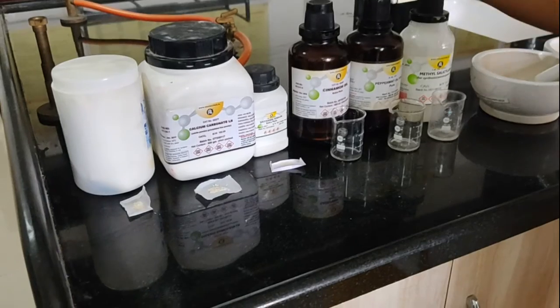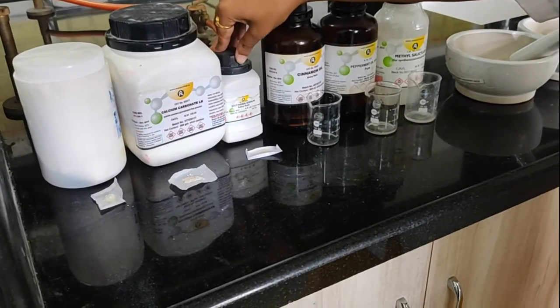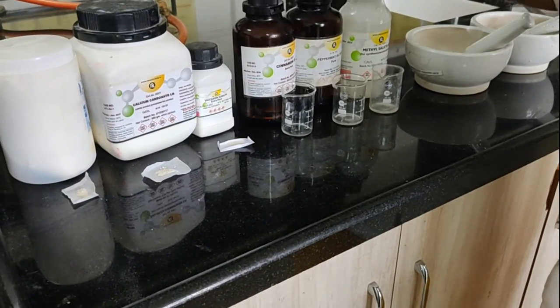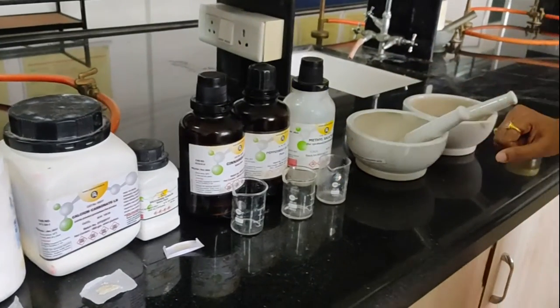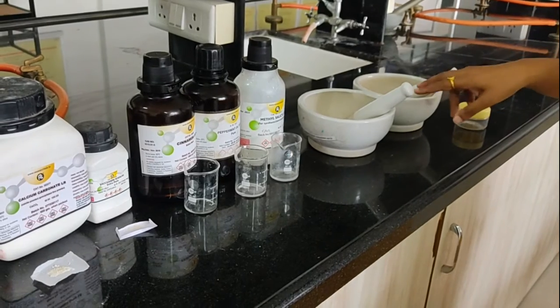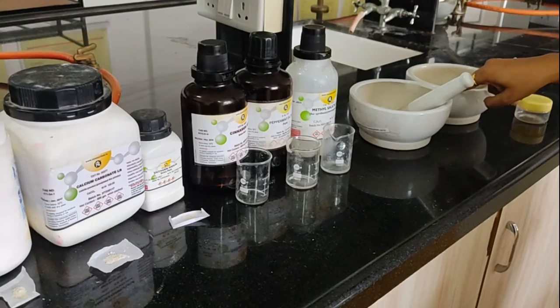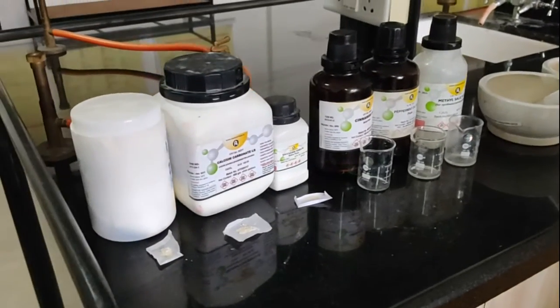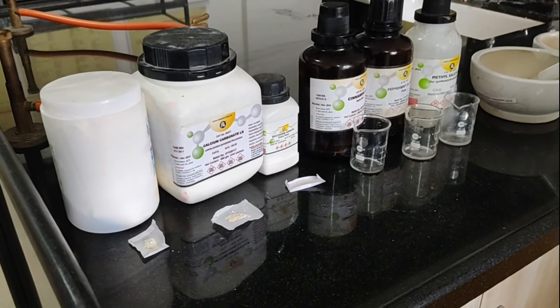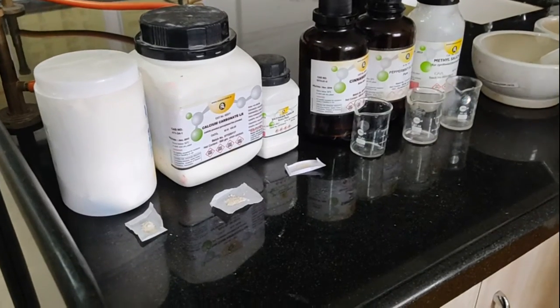So we have hard soap, calcium carbonate, saccharin sodium, then cinnamon oil, peppermint oil, and methyl salicylate. All these are previously weighed. Now I am going to divide all the ingredients into two halves, into these two mortar and pestles, and after mixing them properly in the two halves, we will mix the contents from the two mortars and then proceed to the next part.